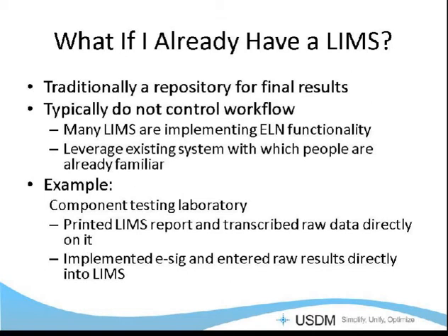I can give you another example of a testing laboratory where they were actually printing out what we call the summary report, the final results of the data that they submitted to QA for review. They were printing this out and writing raw data onto the sheet and then entering it into LIMS. So what we did is we implemented an electronic signature.